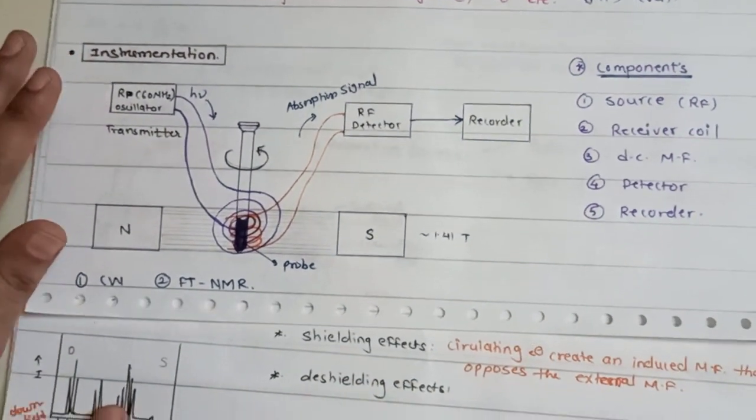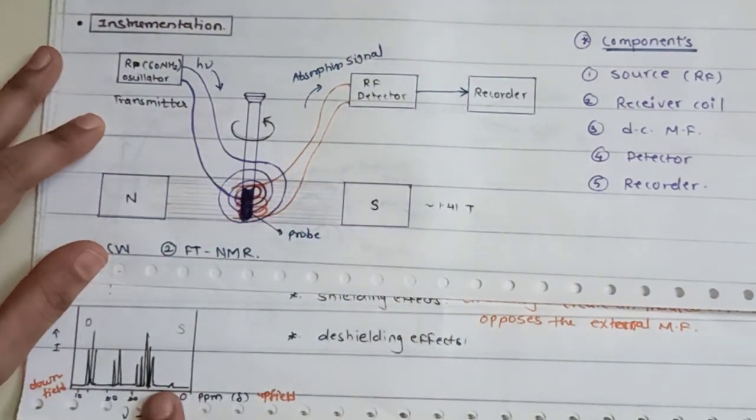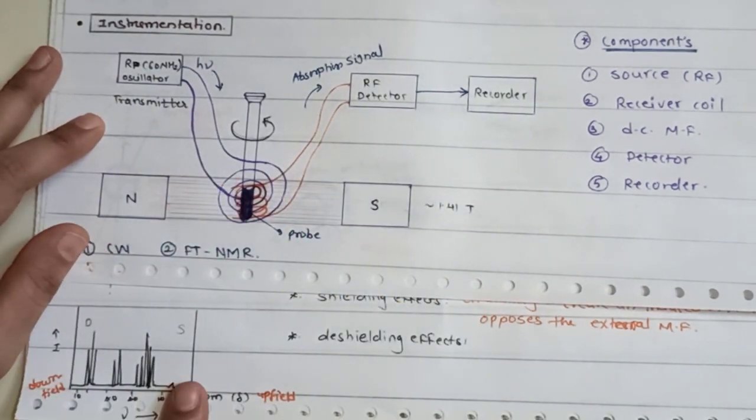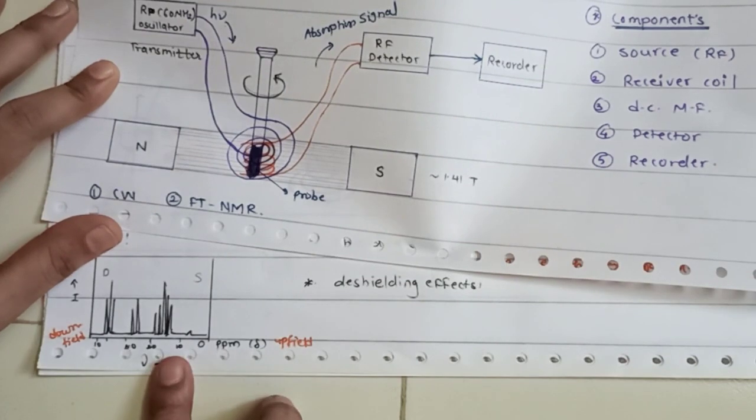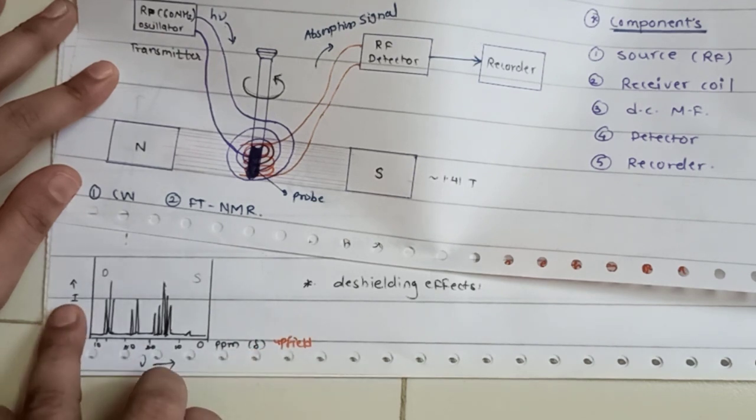तो जैसे कि आपने देखा होगा IR देन मास में भी आपको कुछ स्पेक्ट्रम मिलते हैं, तो यहाँ पे after the instrumentation you will get such type of the spectra. तो इसे हम लोग बोलते हैं NMR स्पेक्ट्रम. तो ये स्पेक्ट्रम होता है बेसिकली आपका इंटेंसिटी वर्सेस फ्रीक्वेंसी. ठीक है, इंटेंसिटी वर्सेस फ्रीक्वेंसी, whereas the frequency will be recorded in terms of ppm, जिसे यहाँ पे हम लोग कैरेक्टराइज करते हैं बाय सिंबल डेल्टा. ठीक है, and these are their intensity.